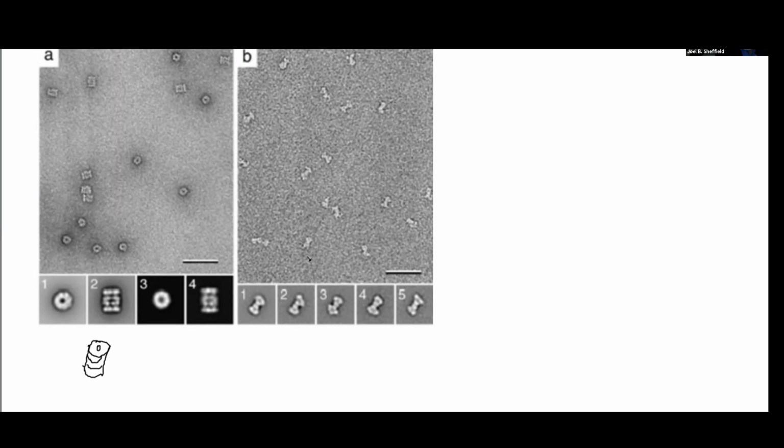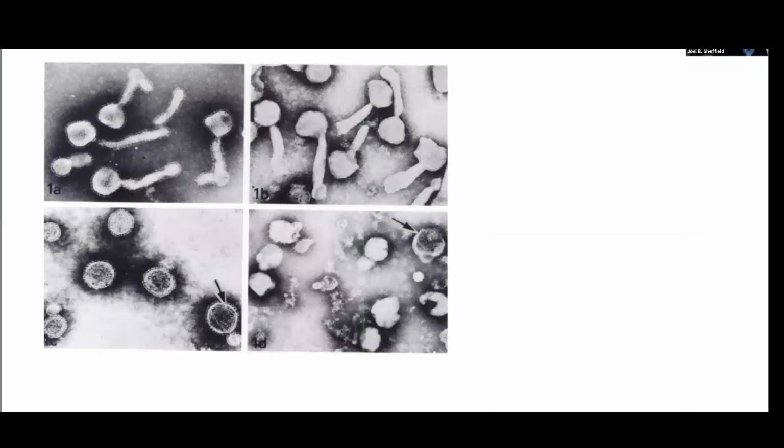This is another example of how you might be able to take a series of not quite so well-defined molecules, but by superimposing them, create a kind of a set of views that makes sense of that protein. Okay? And then I want to show you one more, almost as a warning. And I'm afraid this is a personal story.